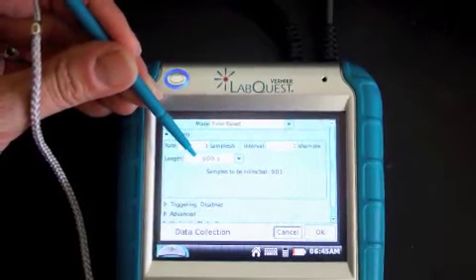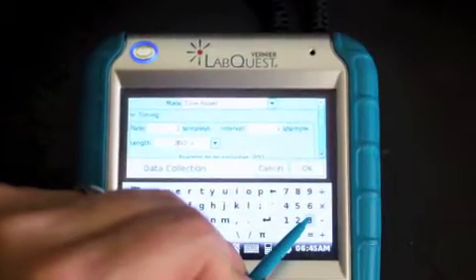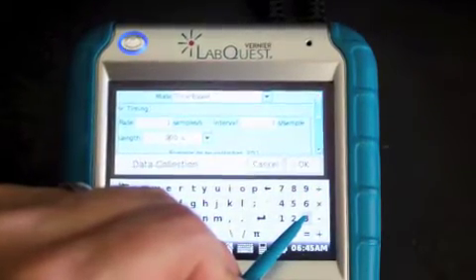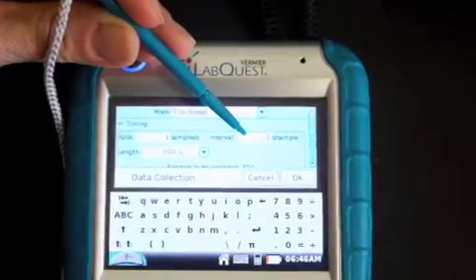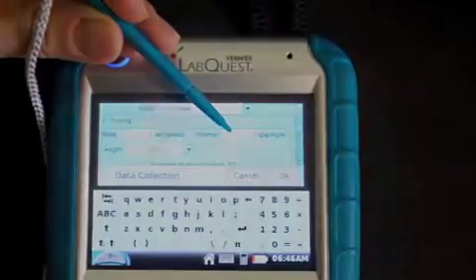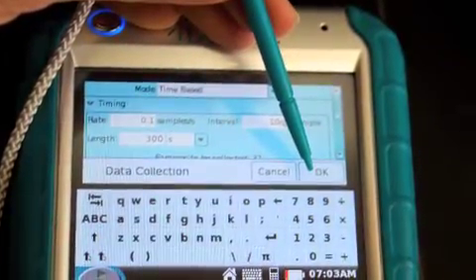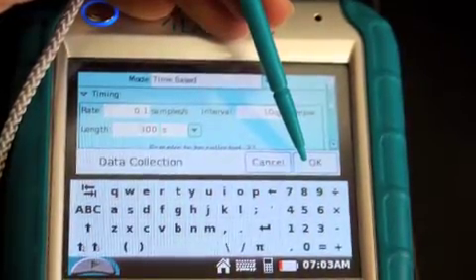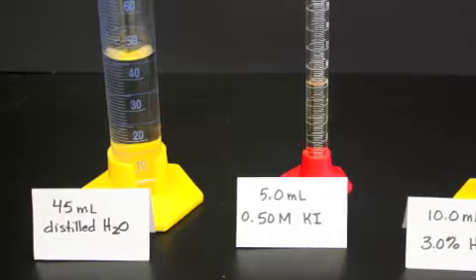Merely click the box and a small keyboard will pop up on the screen and you can just enter the length of time you want, in this case 300 seconds. The next thing we want to change is from 1 second per sample to 10 seconds between samples. It'll reduce the amount of data points and not make our data so cluttered. So again, just touch the box and enter 10 seconds between samples. Now click OK.